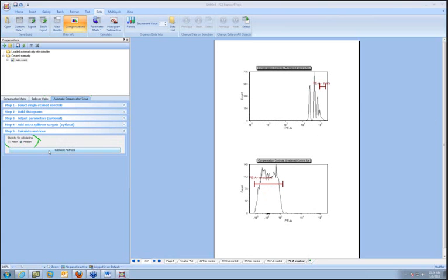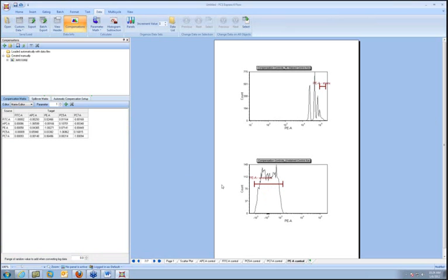Okay, the compensation matrix and the spillover matrix is set up for you already. You can see here's the spillover matrix. There's one on all of the diagonal elements, as you would expect when doing automatic compensation, and then all of the spillover coefficients have been calculated for us, and then the compensation matrix, of course, is the inverse of the spillover.